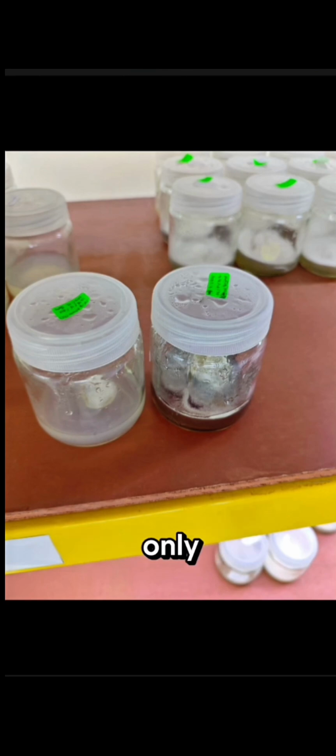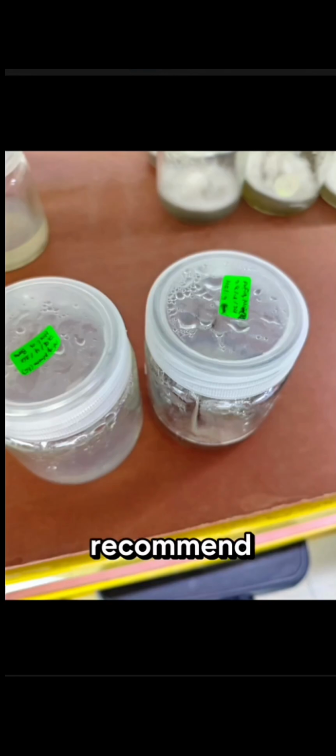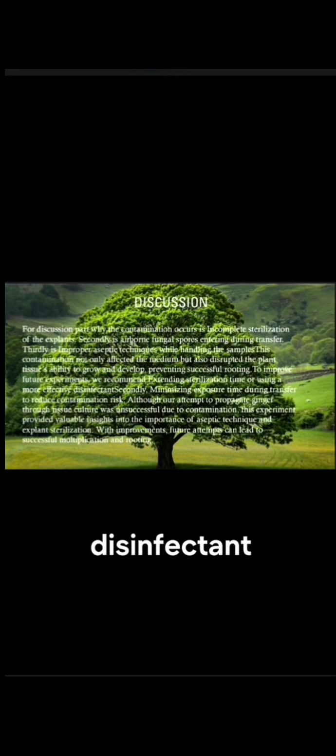The contamination not only affected the medium but also disrupted the plant tissue's ability to grow and develop, preventing successful rooting. To improve in future experiments, we recommend extending the sterilization time or using a more effective disinfectant. Secondly, minimize exposure time during transfer to reduce contamination.